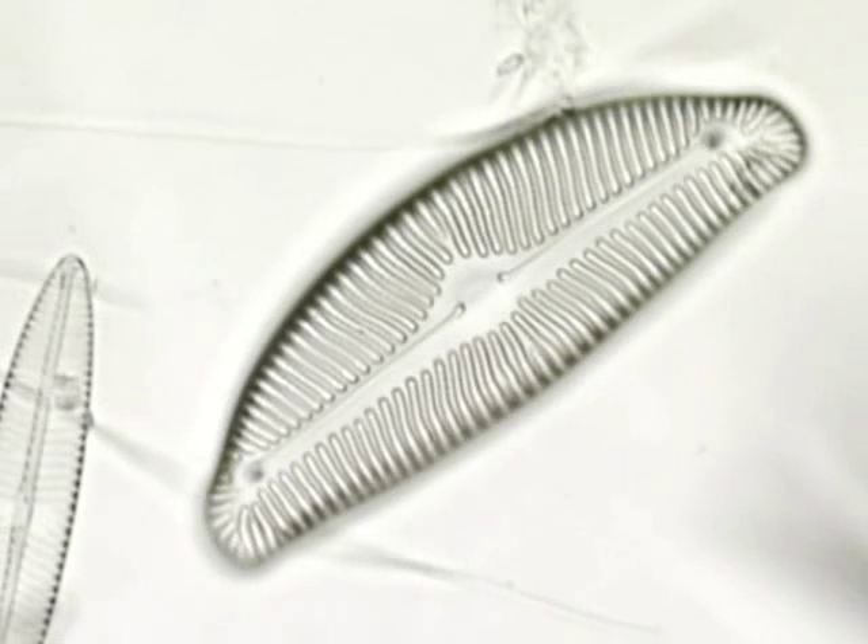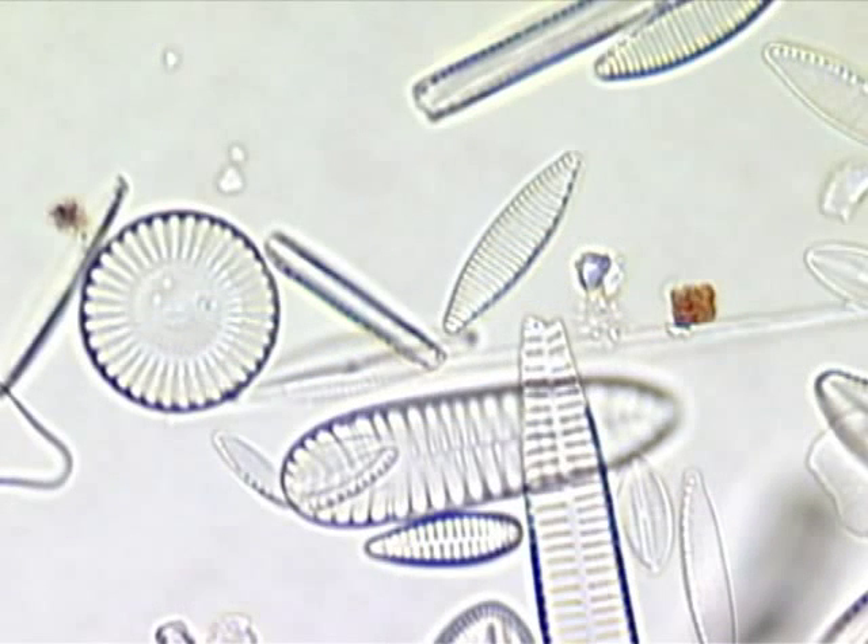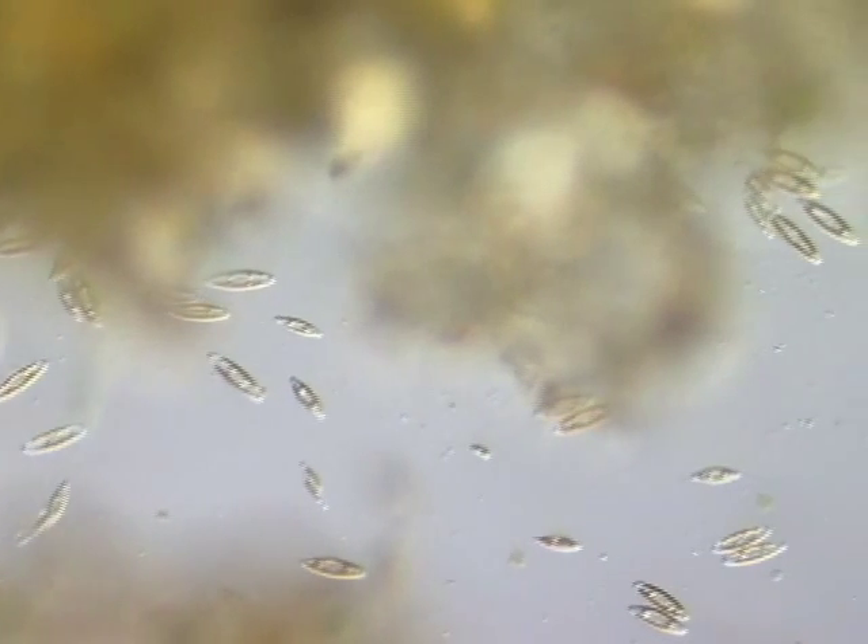The glass shells of diatoms are ornamented with detailed patterns. These patterns are very useful in identifying the different species of diatoms. However, the patterns of the glass shells of living diatoms are not easily visible.